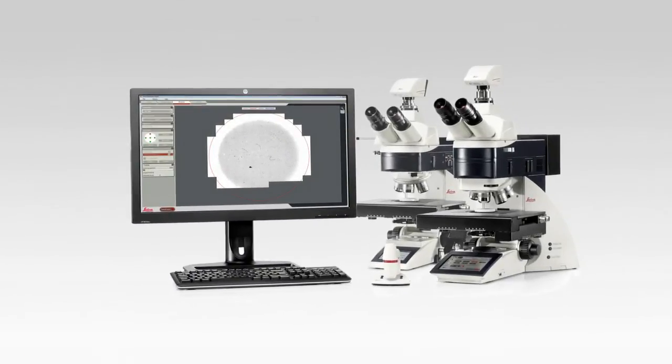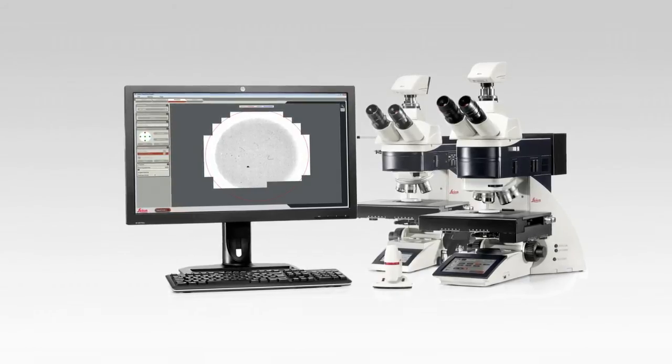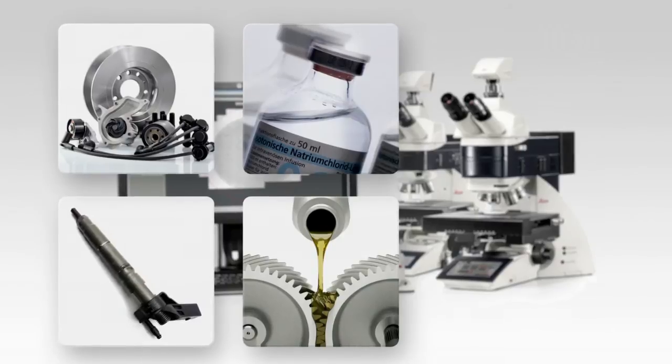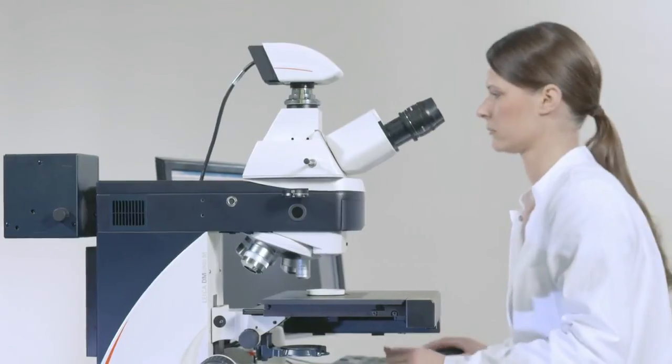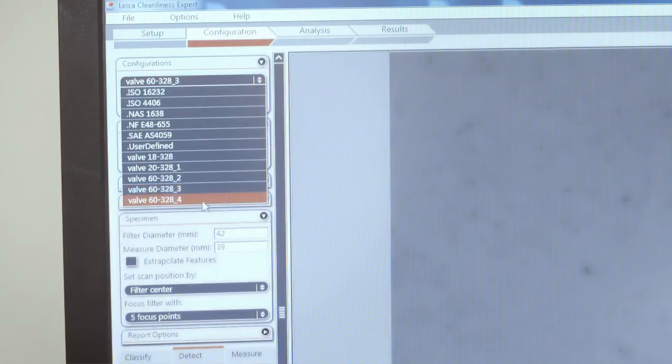With the Leica DM 2700M, DM 4000M LED, and Leica DM 6000M offering an ideal solution for high volume throughput, the high degree of automation makes it simple for every employee to operate the system, allowing measurement to be carried out next to the production line.